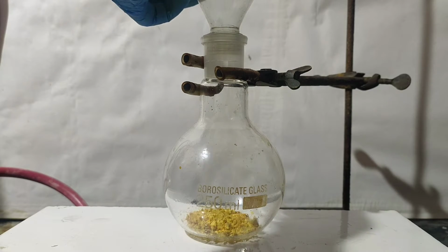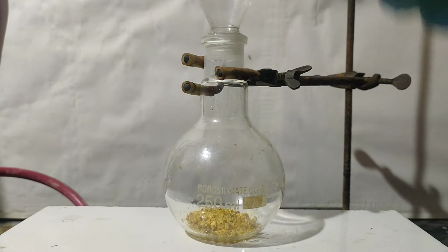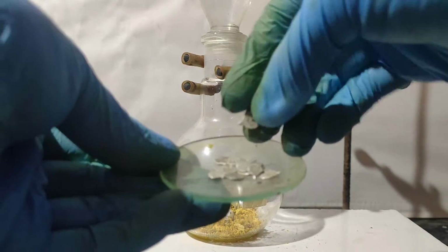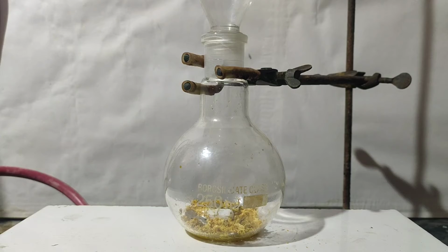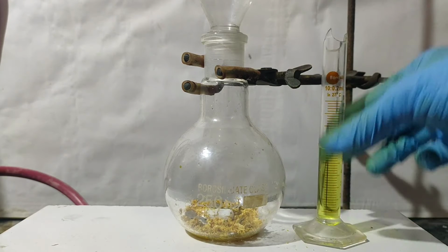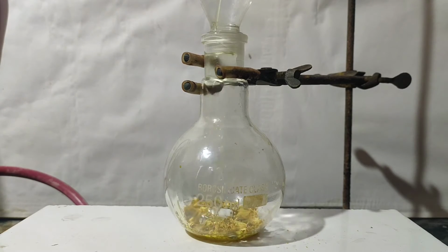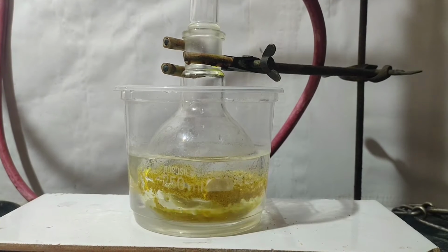In a flat bottom flask, I added 2.5 grams of alpha nitronaphthalene. Then I added 2.6 grams of tin granules, which were flattened with a hammer to increase the surface area. Then I added 6 ml of concentrated hydrochloric acid. Then to start the reaction, I switched on the stirring and heated it on a water bath with a reflux condenser.